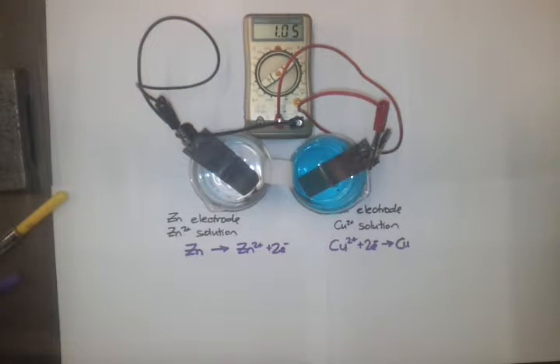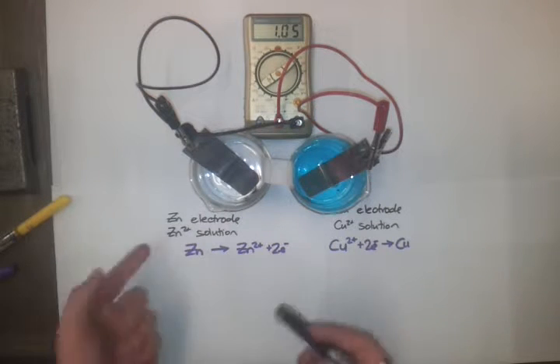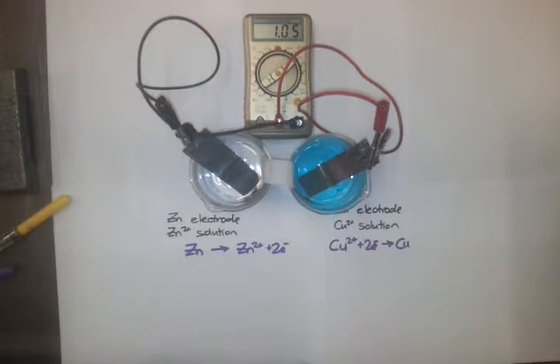So if we left this for long enough, we'd see that the zinc would start corroding away or disappearing as it gets turned into zinc 2+, and the copper will get more and more copper on it, and the blue solution will start to fade.